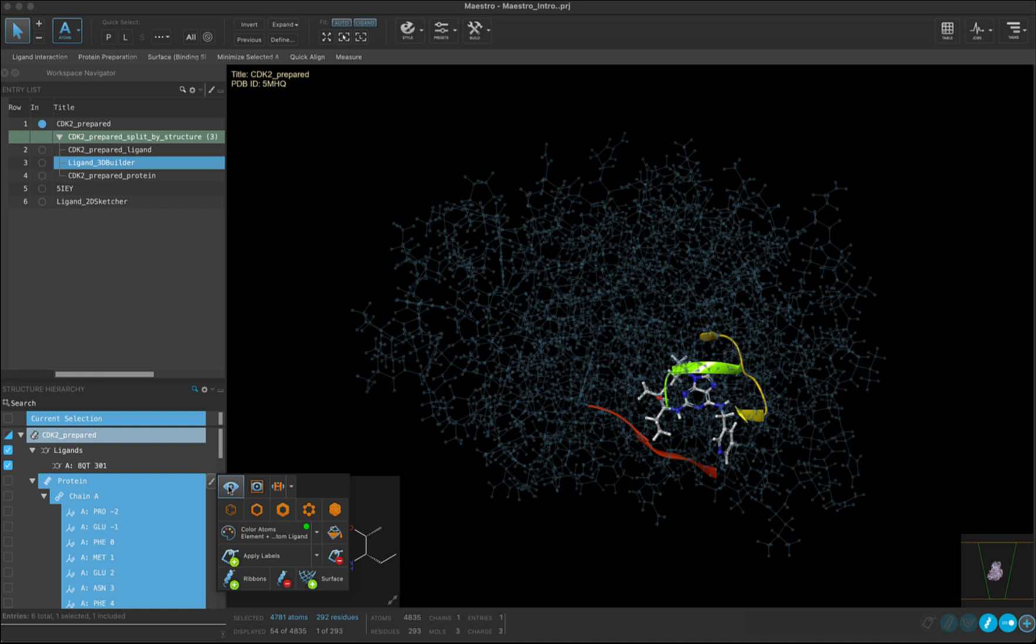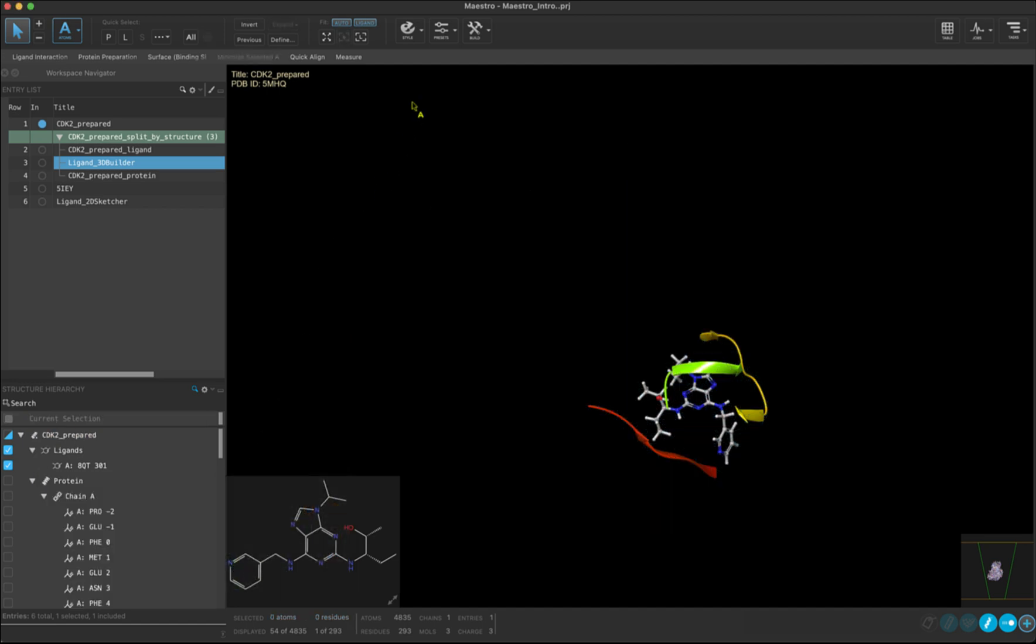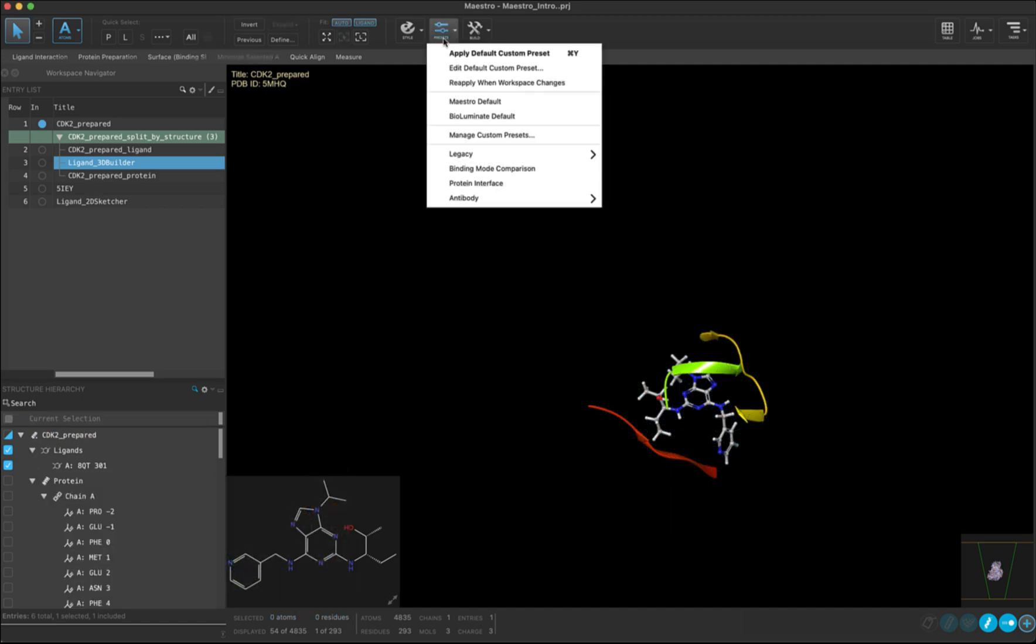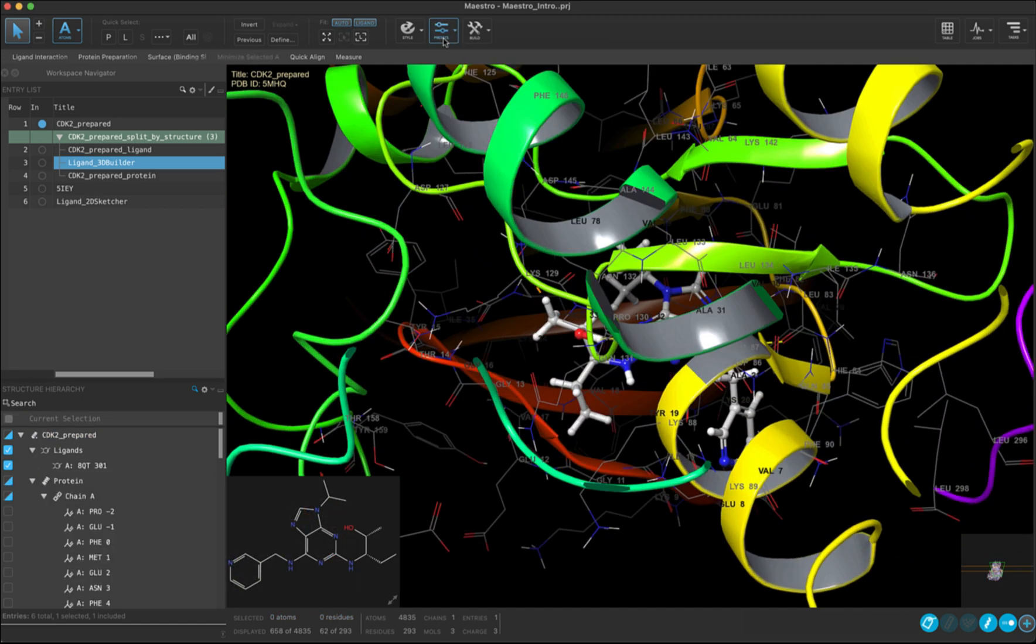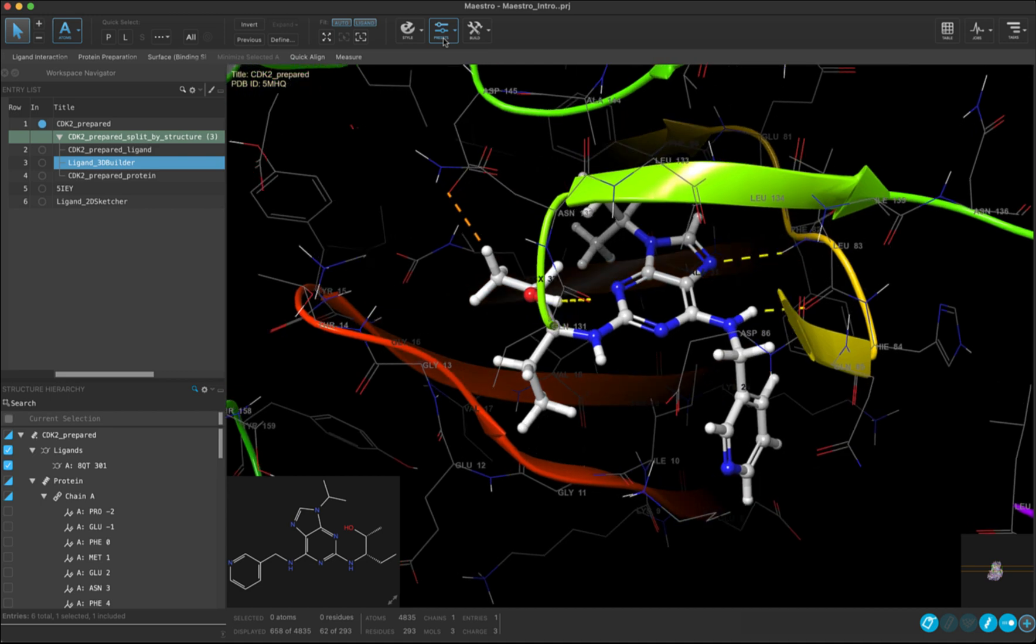If we want to reset the view to how we just had it, we can come up once again to presets and double click to reset the view so that residues that are within a certain cutoff distance from the ligand are displayed.